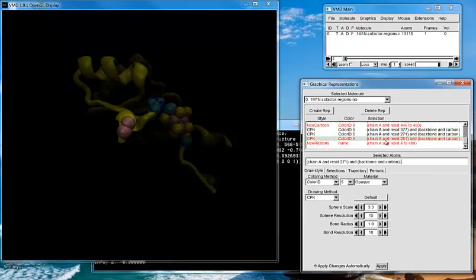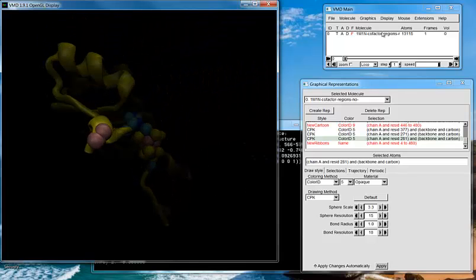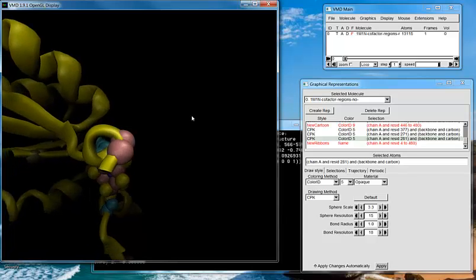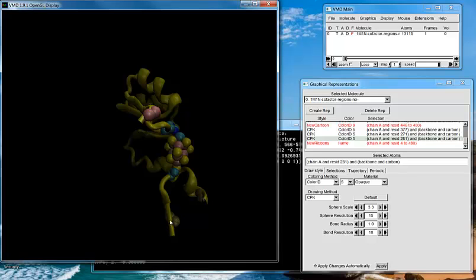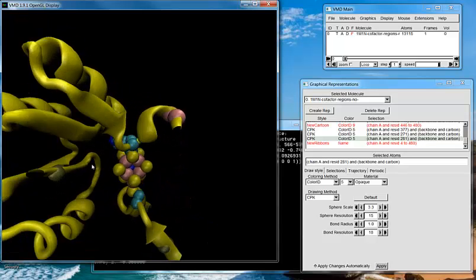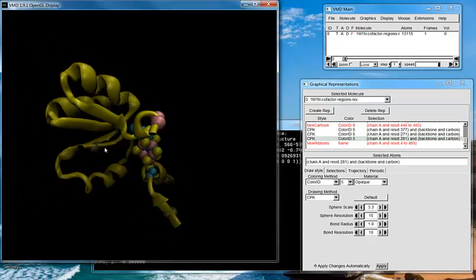So I'm going to show these CPKs as well. And the lighting's a little bit off. So now you can kind of see, I've drawn this so you can see where these 2 carbons come in together here. Same thing right here and right here. So I've done this in all 4 different places just so that we can do some trimming on these different pieces so we can glue everything together once we print this off.